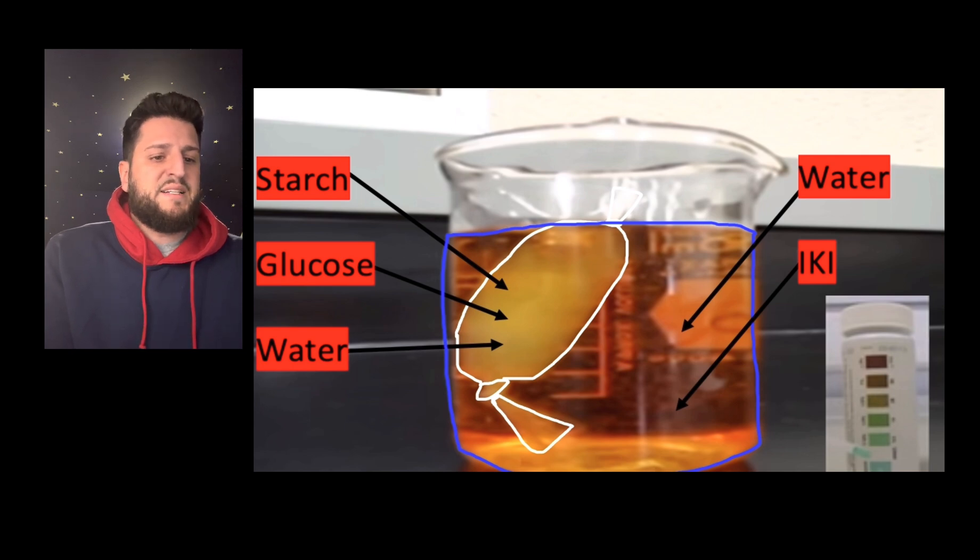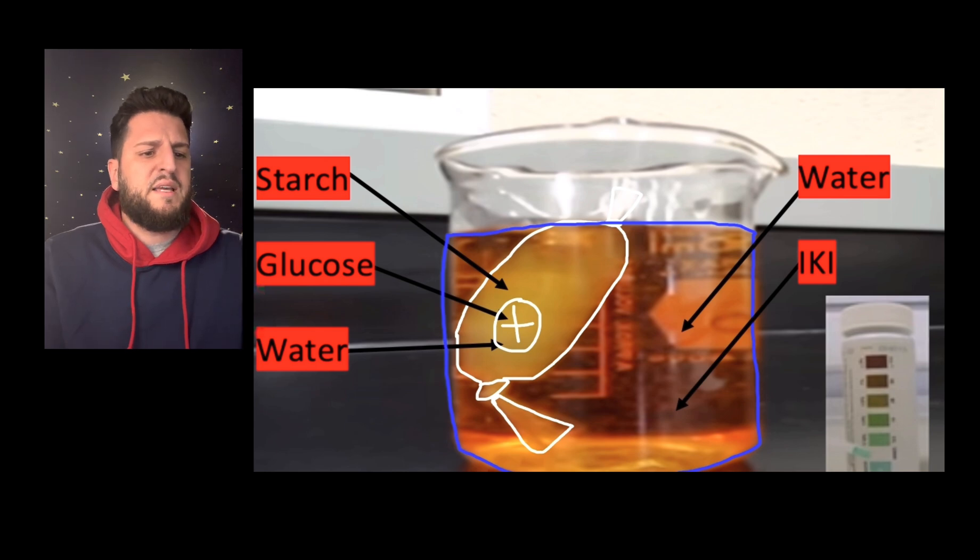To start, you would take a test strip and insert it into the fluid. It would start as a blue color and then can move all the way up to a red color. If we took a test strip and put it inside the dialysis tubing for the presence of glucose, we would get a positive test result because there is glucose inside the dialysis tubing. If we were to take a test strip and test the outside of the dialysis tubing, we would get a negative reading for glucose.